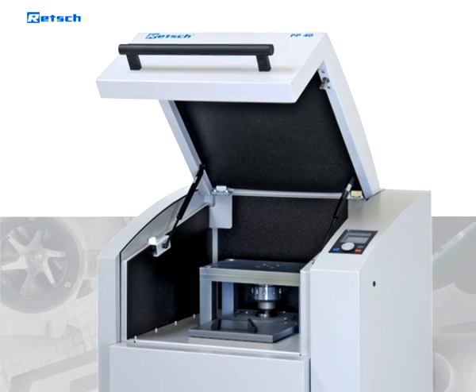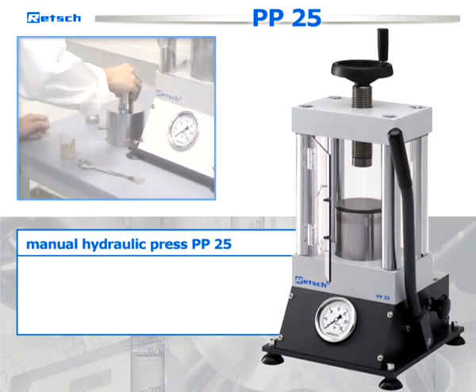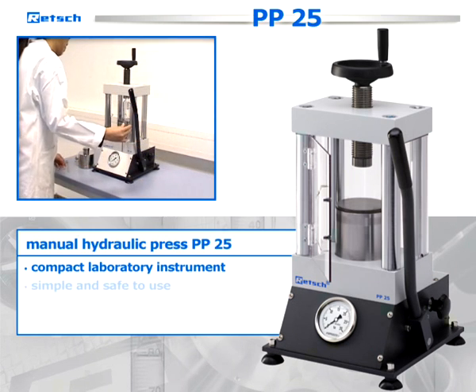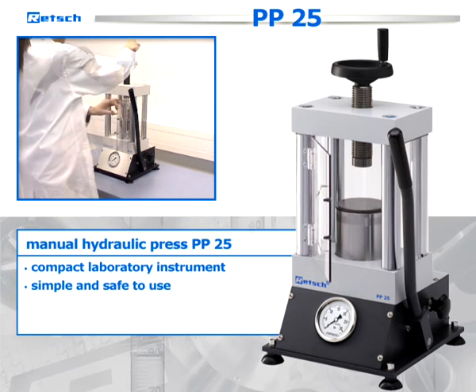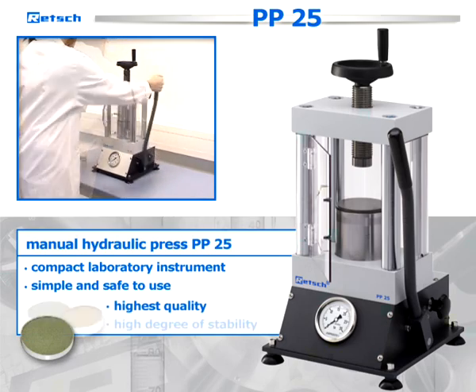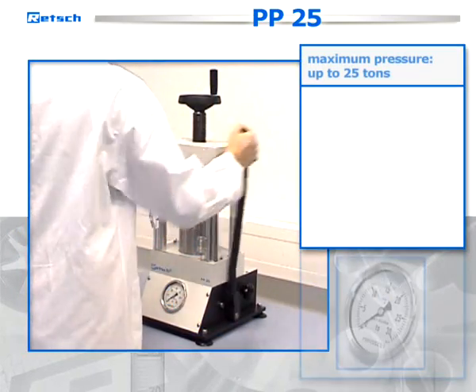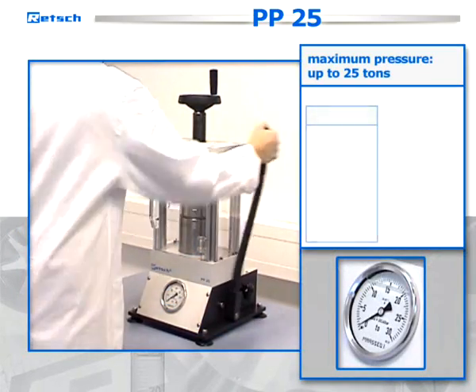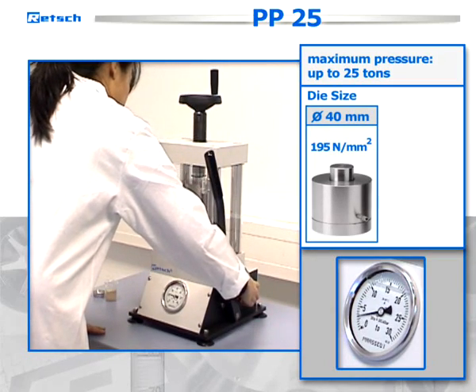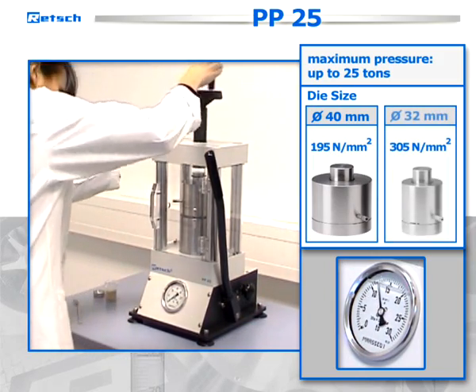In addition to the heavy-duty floor model, RETCH offers the manual hydraulic press PP25. The space-saving benchtop model is a compact laboratory instrument that is particularly simple and safe to use. Despite the simplicity, the pressed pellets are of the highest quality and are characterized by their high degree of stability. When the maximum pressure of up to 25 tons is indicated, the press exerts a pressure of 195 newton per square millimeter on a 40 millimeter die and even 305 newton per square millimeter on a 32 millimeter die.